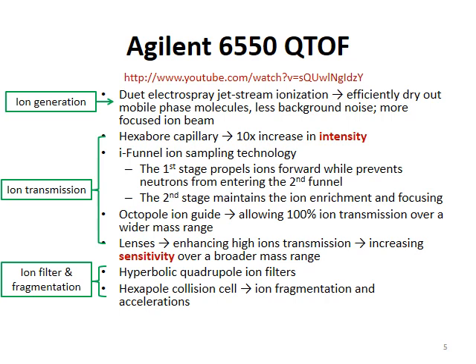Okay, this slide, you can treat it as a continued illustration of the function of each individual part served for the whole QTOF instrument. And instead of using the figure to illustrate, I actually use some sentences to illustrate the functions.